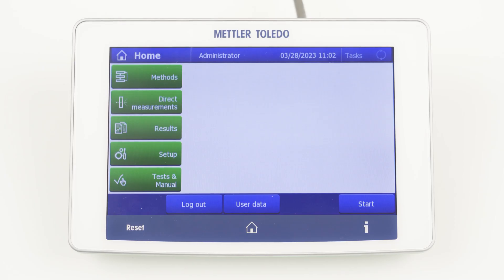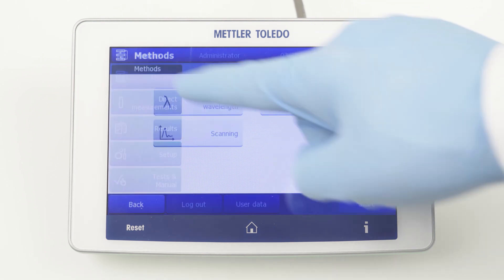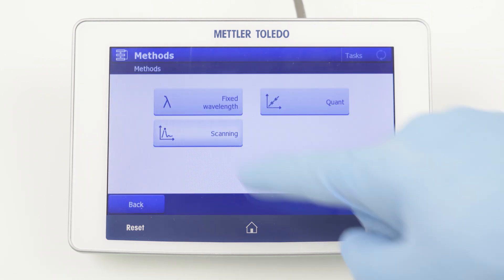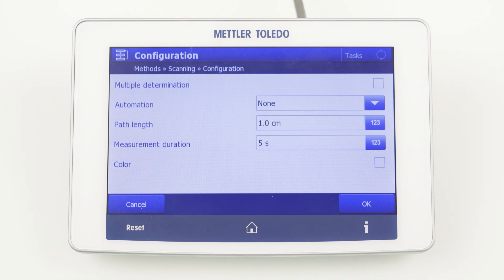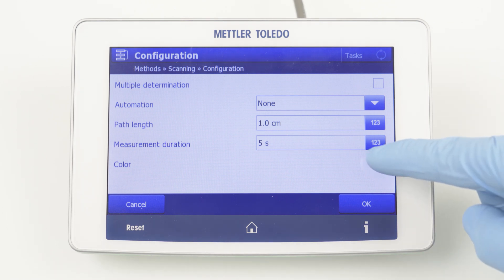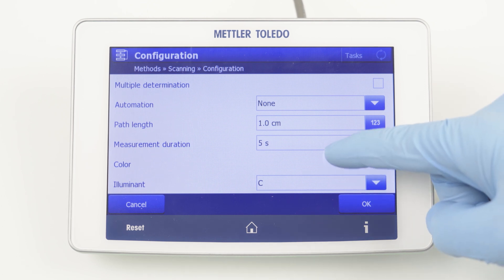Let's start with the method configuration. To create a new method, click Methods and select Scanning. All predefined color calculations are located in Scanning, even if no full spectrum is required for the color calculation. By clicking New, the method configuration is started. To unlock color calculations, you have to activate Color.